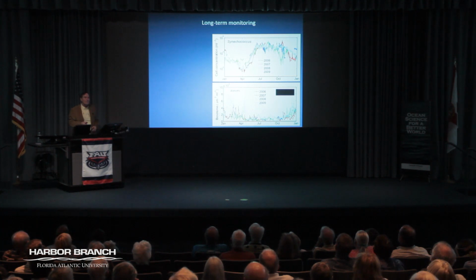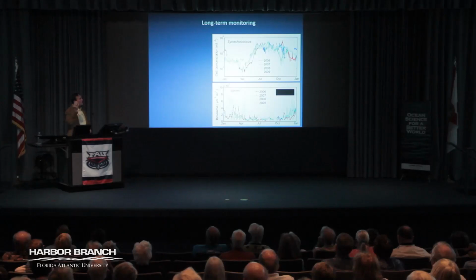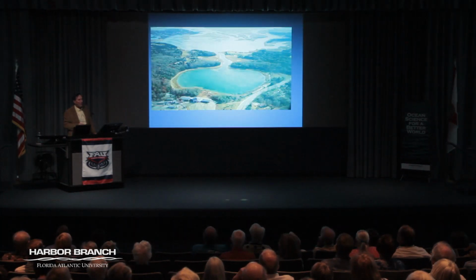It's an incredible data set to look at climate change or changes in pollution. You don't have some technician who's been counting your cells leave and go take a new job, and you have someone else come and try to learn how to count, so that the data are questionable from year to year. This is being done with the same software year after year after year. So back to our use of the IFCB.